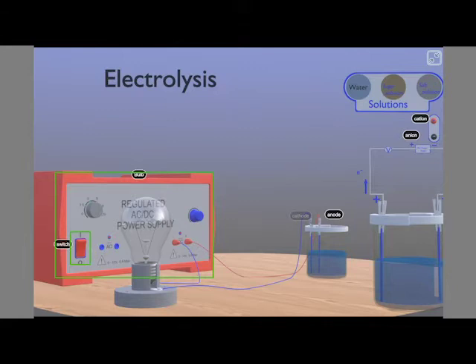We also have a light bulb here, and the light bulb is used to show if electricity is being conducted. We have some connecting wires - the red one here and the blue one here.